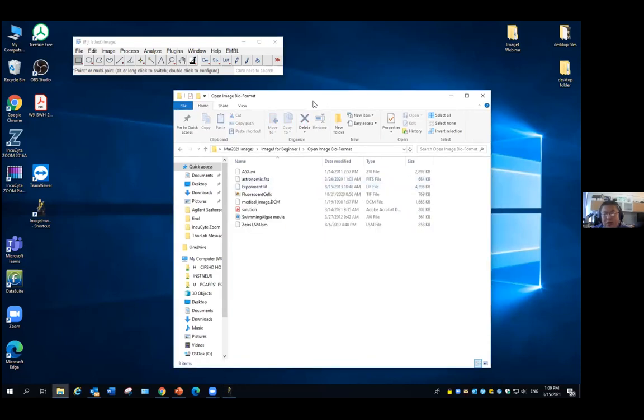I think the greatest advantage of ImageJ is that it can open almost every scientific equipment image format, compared to other commercial software like MATLAB, Imaris, or Velocity. Once you have an image from scientific equipment, it's almost certain there's a plugin already installed in ImageJ that can open it.